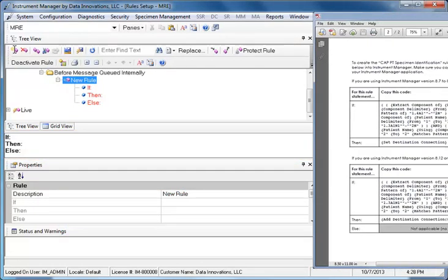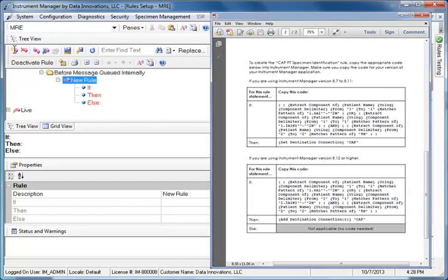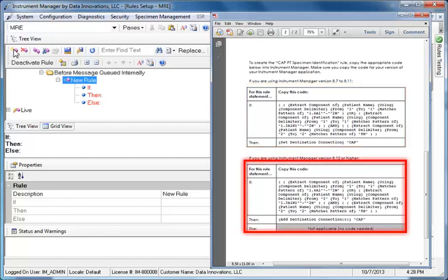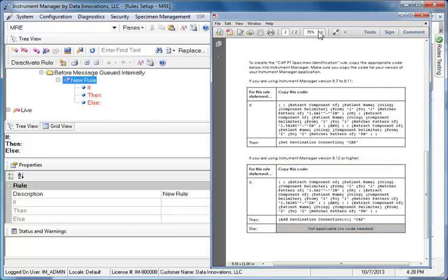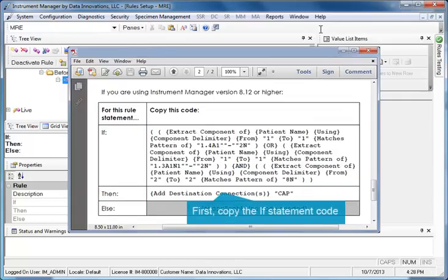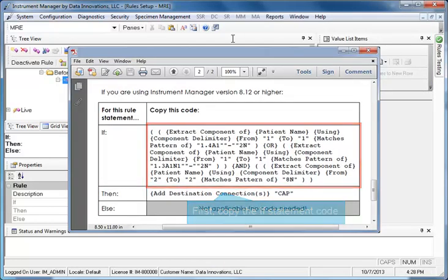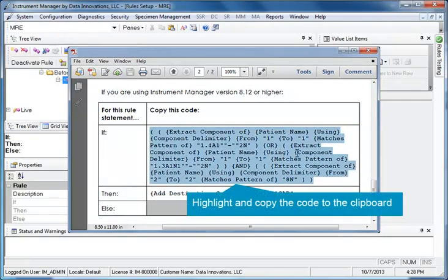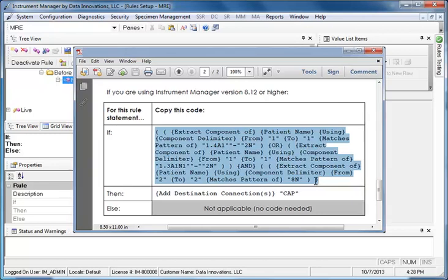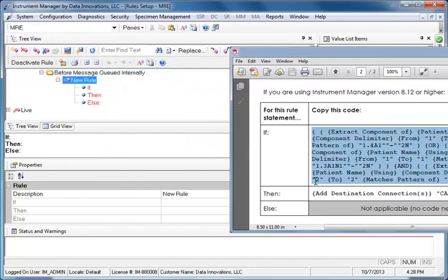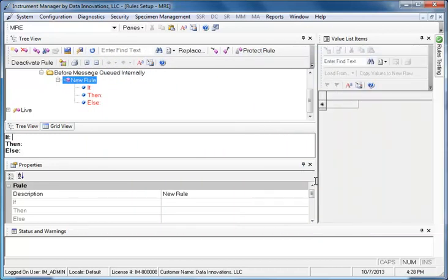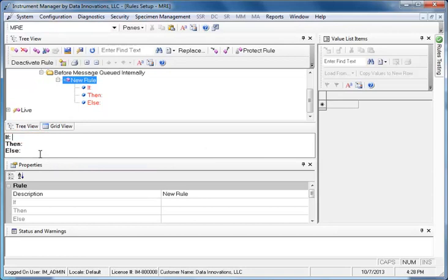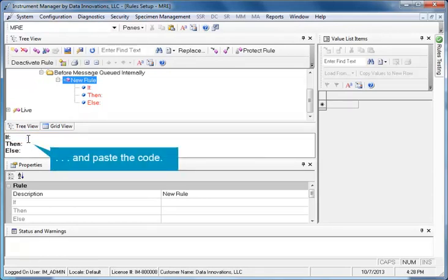Switch over to the User Guide on your computer to find the code. Note that there is more than one version of this code. Make sure you copy the code for your version of your Instrument Manager application. First, copy the If statement code for the rule. Highlight the code and copy it to the clipboard. Switch back to Instrument Manager. Click next to the If heading and paste the code.